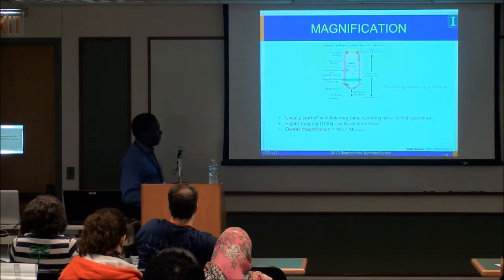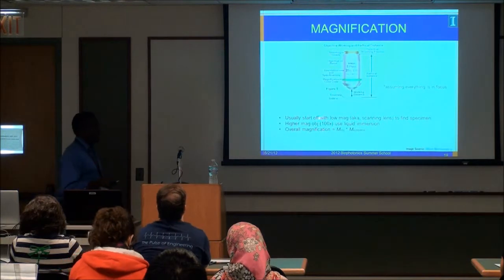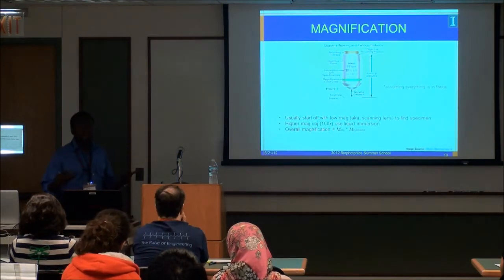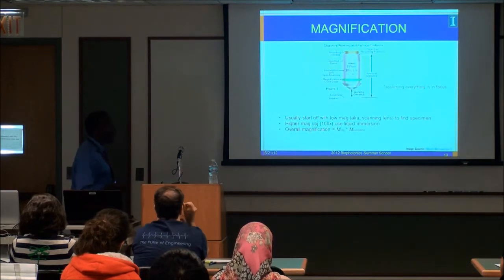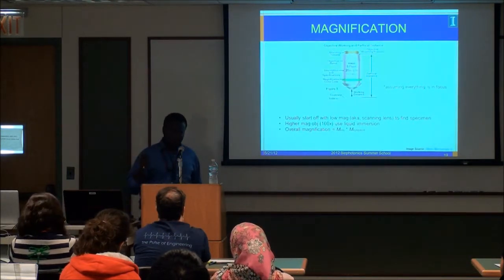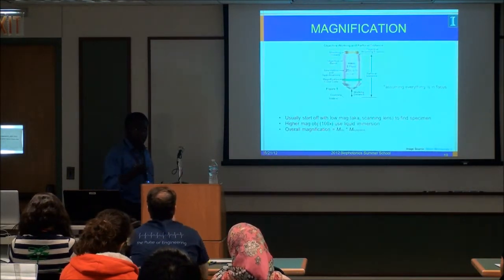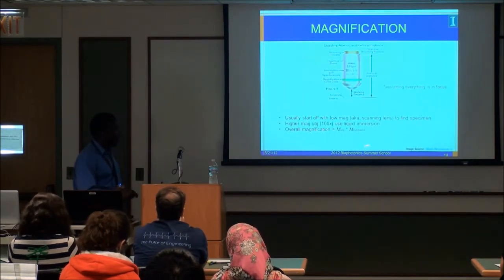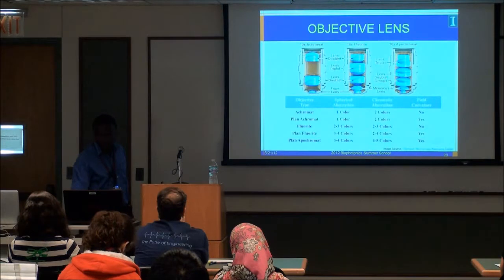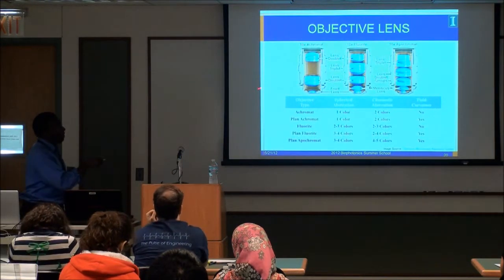Usually, from a practical perspective, if one was starting off in a lab working with a microscope, you typically would start off with what's called a scanning lens. So that's a low magnification lens, 5x, 10x. That allows you to find roughly where your sample is, the thing you're trying to image. And then once you find it, you can zoom in with a higher magnification objective, bearing in mind that once you go to higher mag, you typically are using some type of oil immersion or liquid immersion optics. Everyone's comfortable with why we use liquid immersion optics in the first place, to boost the numerical aperture. If you're not, just let me know. And the overall magnification, typically if you're using an eyepiece, for instance, is going to be the objective magnification times the eyepiece magnification, which typically is roughly about 10x. So this here is to give you all an idea of the different lens types.